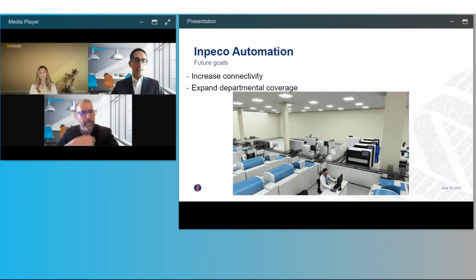Thanks, Rob. Let me just add that in our presentation, we actually showed some numbers. We have this also on our website, inpeco.com. There are some studies, but just to echo what Rob just said, it's going to depend very much on the initial state. So what does standalone mean? How many people are actually working there versus an automated state? What all studies are coincident on is that there is a significant reduction.